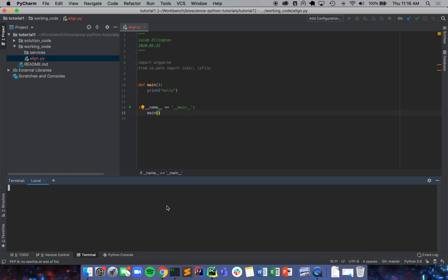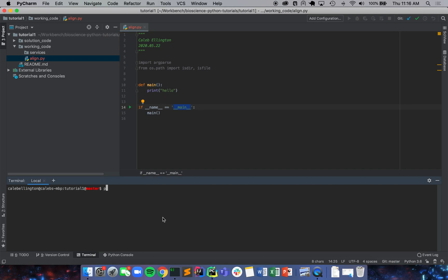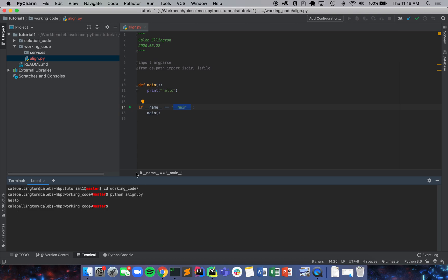So this is basically just telling our program, if you are the program that we are directly running, if you're the main file, run everything below this. And so we're going to run main and we're going to do Python. We're going to change our directory first to working code and Python align.py, and it's going to print hello. So we've got a working structure and now everything within this main method is going to be run anytime we run the program.